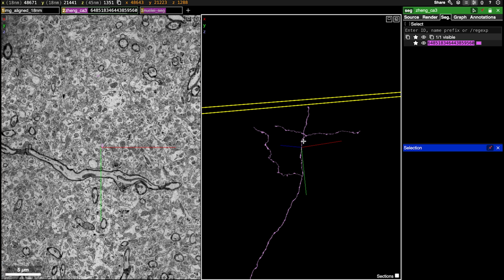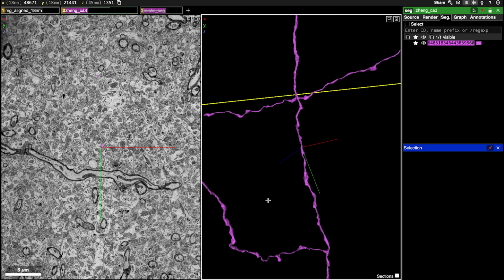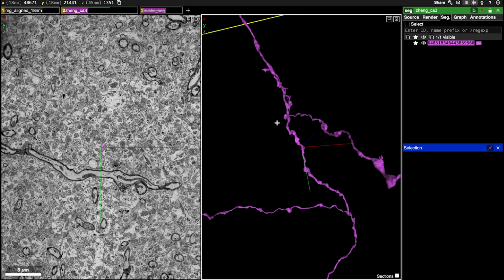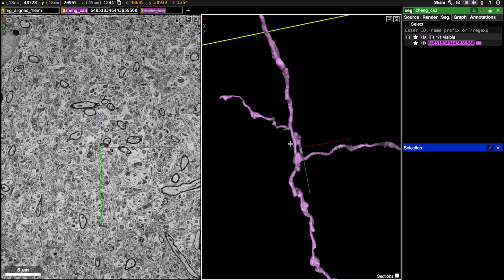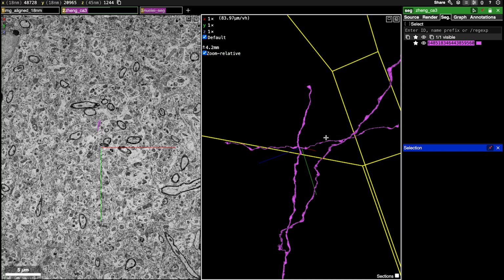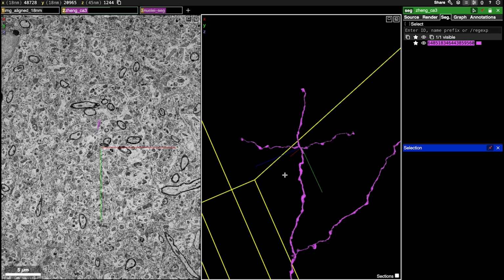which means that we don't really know which of these branches is our correct cell, basically. So for example, in this one, we have a little merger here, but we don't know which of these tasks is the real task, quote unquote. So we're gonna want to do proofreading on both of these tasks, both this one and then this merger branch here. Or maybe this is the real task and this is the merger branch. We don't know, so we're going to complete both of them.